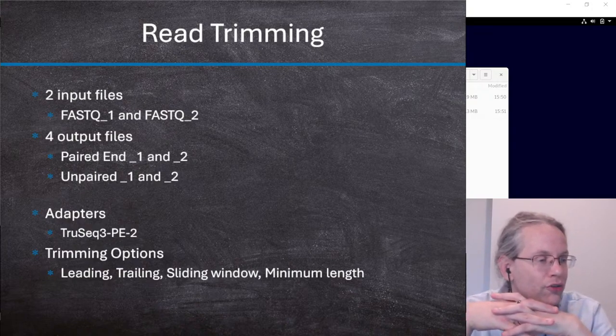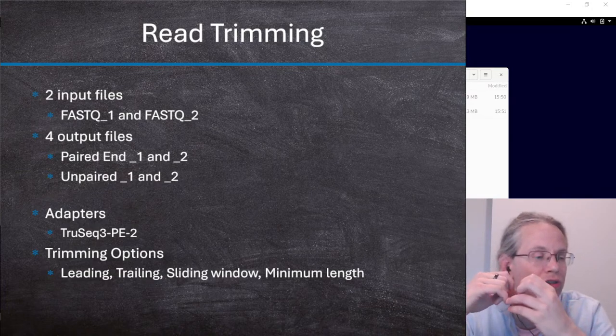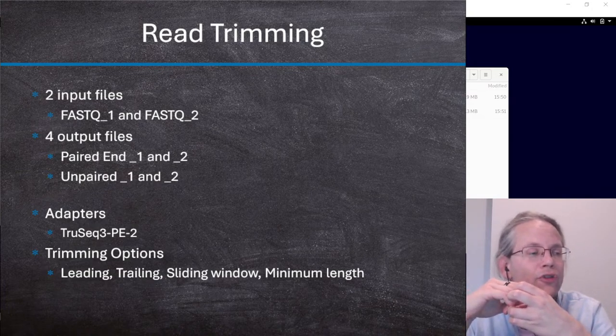Are those also called singletons, the unpaired ones? No, Trimmomatic uses U for them, so unpaired.